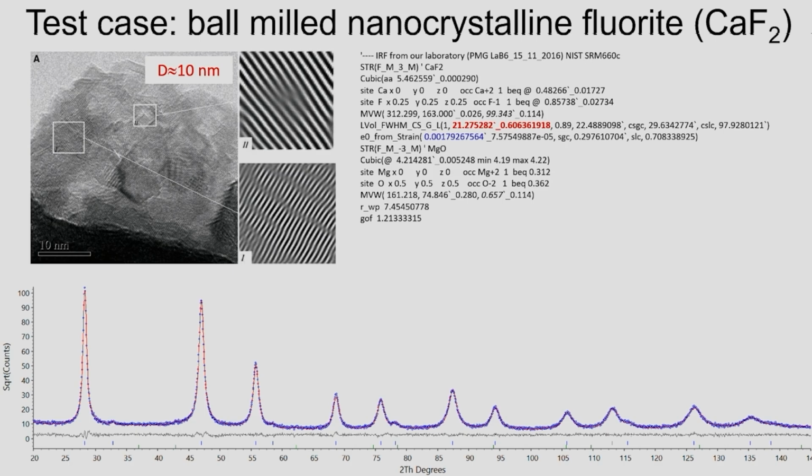So what is the size? Again, now we got 21 nanometers. And if we use the coefficient for spheres, well, things are not so beautiful: 28 against 10. So you see there is something going on here. There are some problems here. Let me show you two more examples, because this might be just bad luck, something gone wrong. You don't want to believe in things from only one sample.